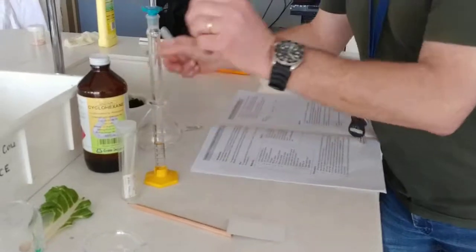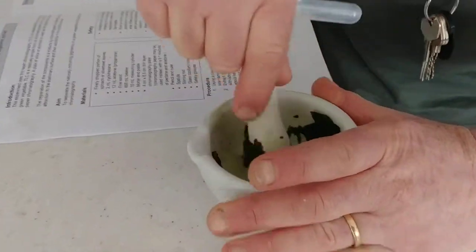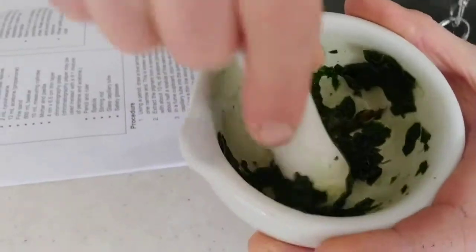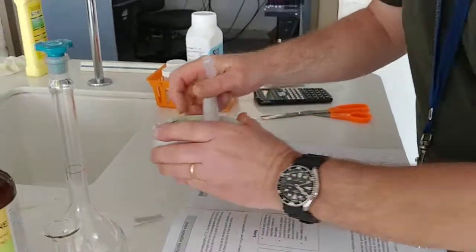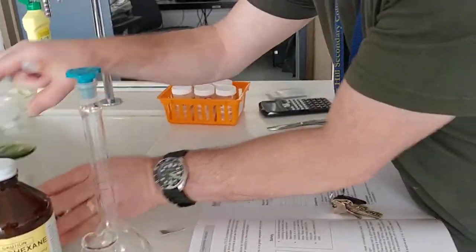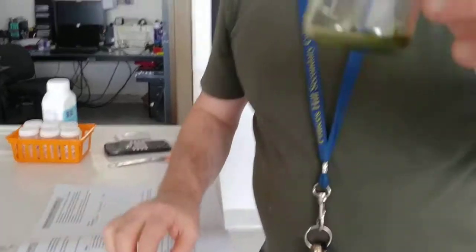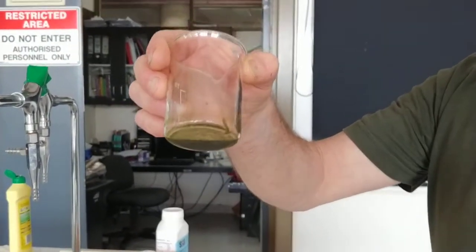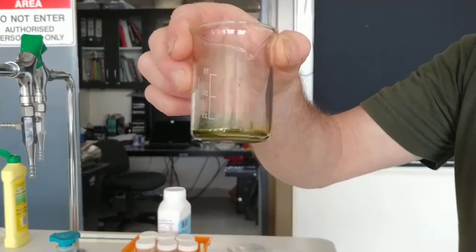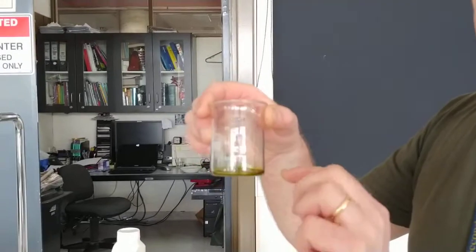So here we have our plant. We've put it into our mortar and pestle, and we're really grinding away here. And you can see there, we're starting to get a juice coming out of it. And voila, we've got our juice. So that's what it looks like. And it's a very greeny sort of suspension solution.